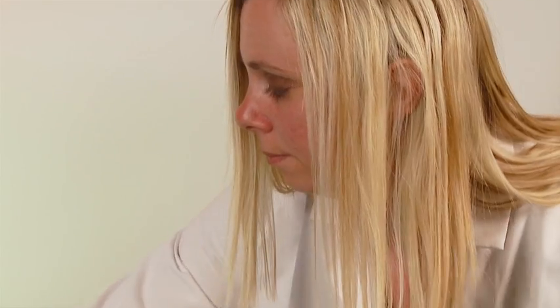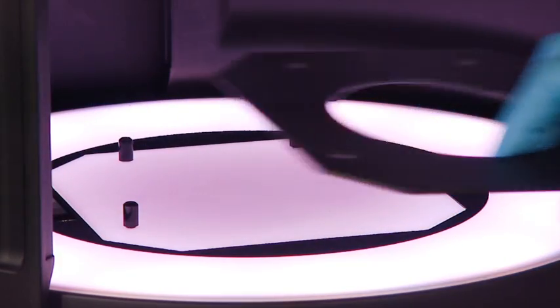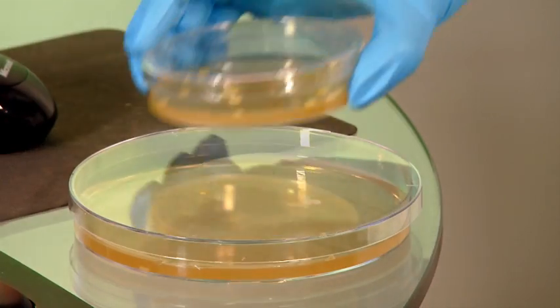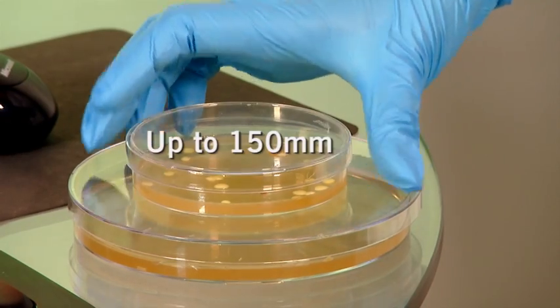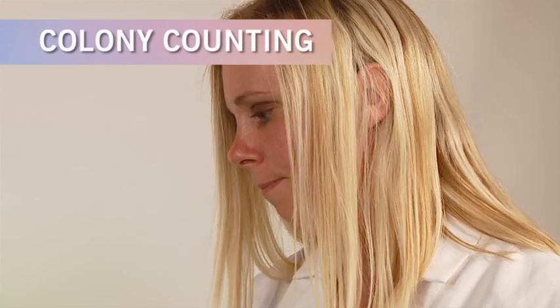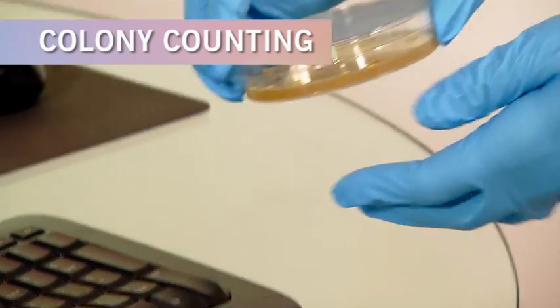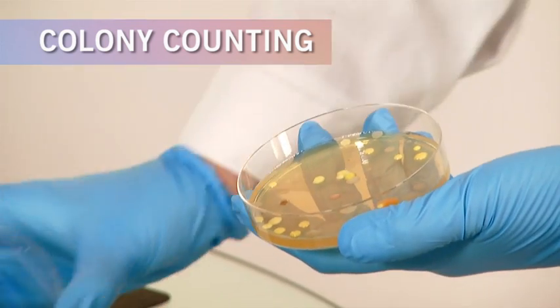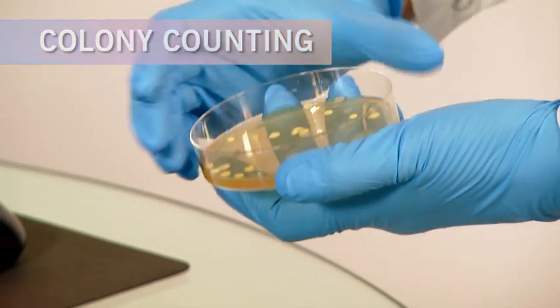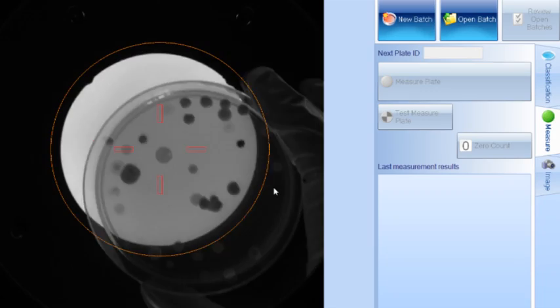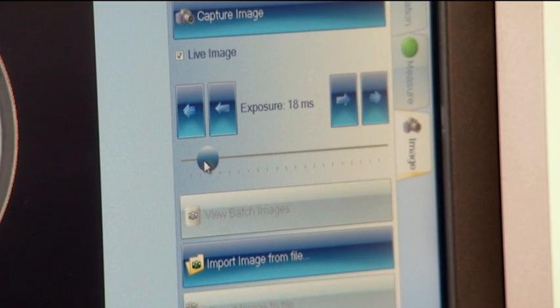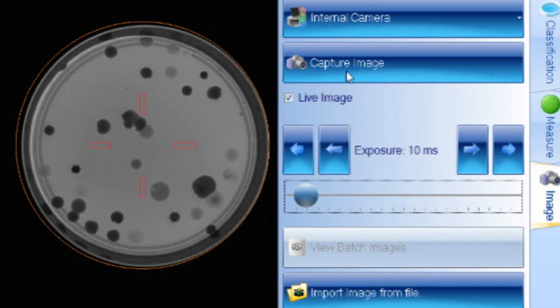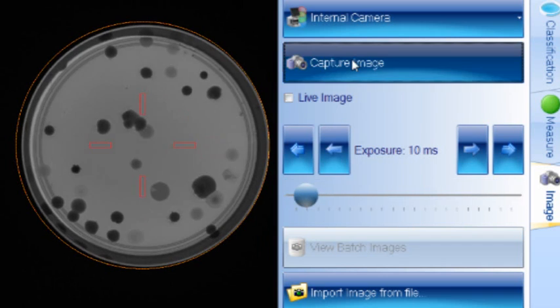A variety of plate sizes can be measured, up to 150 mm in diameter. Begin by selecting the suitable lighting conditions and place the sample on the plate holder. Adjust the exposure as required to get the best quality image, then select Capture.